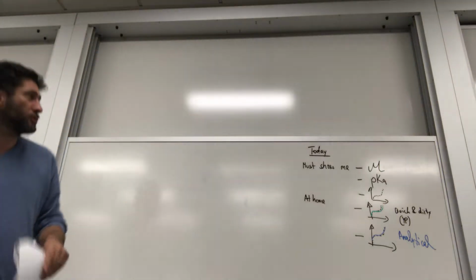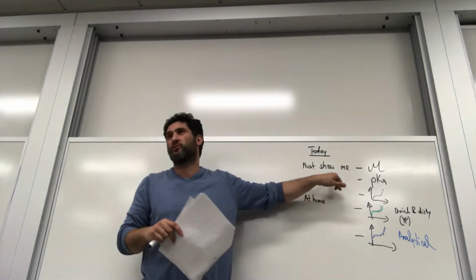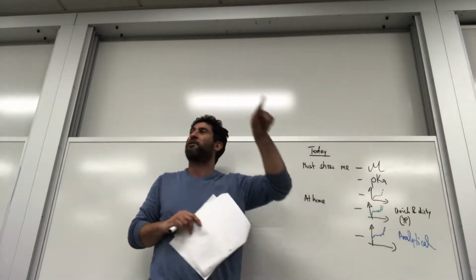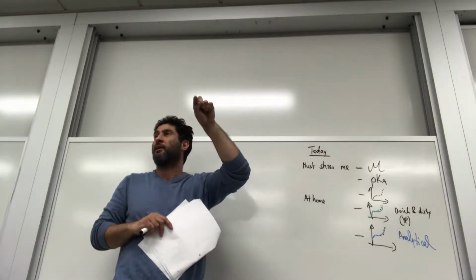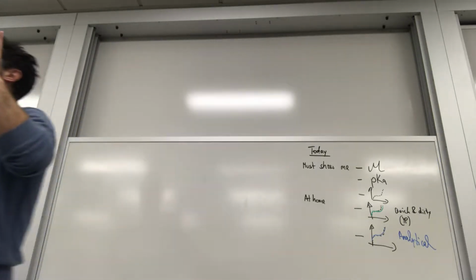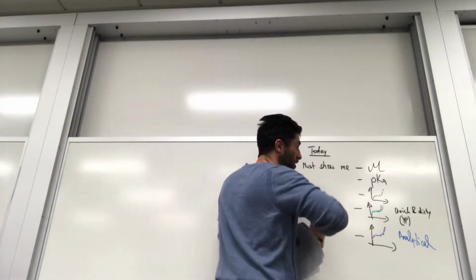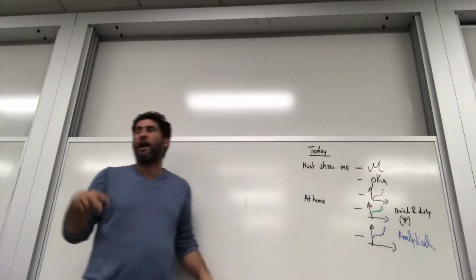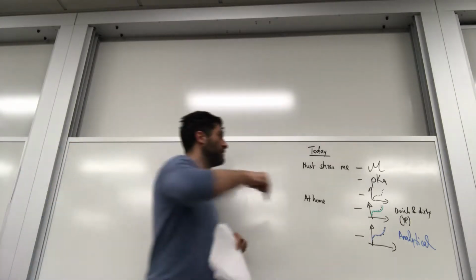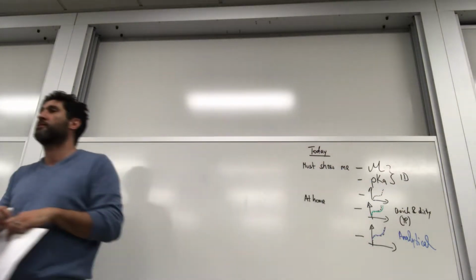All right. So for today, what I need you guys to show me in order to be done with the lab is a simple plot of your data in Excel where you inserted your information that you have from the pH meter reading, and show me a curve like this where I see the dots. I also need to see the pKa for your unknown acid and your molar mass, and from those two things we're going to ID your unknown acid.